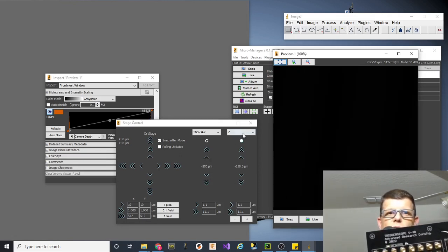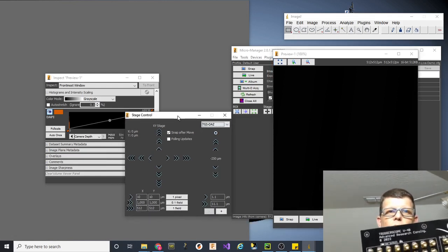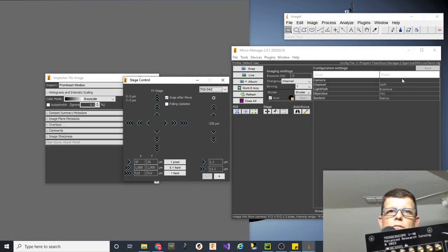This other Z control here, this is controlling the emulated MicroManager Z stage. We can just get rid of that right now. Cool. So this works, and that's what we want it to do.